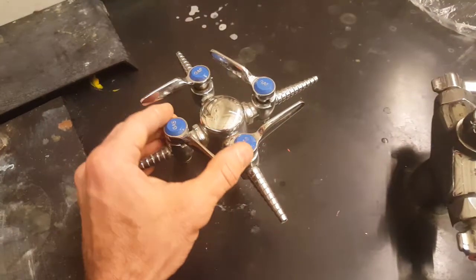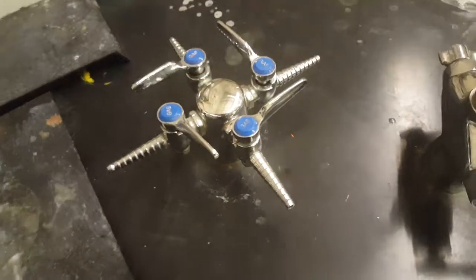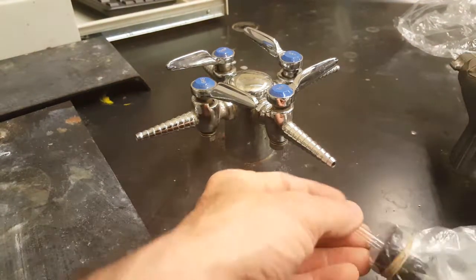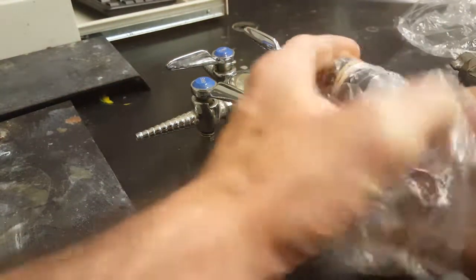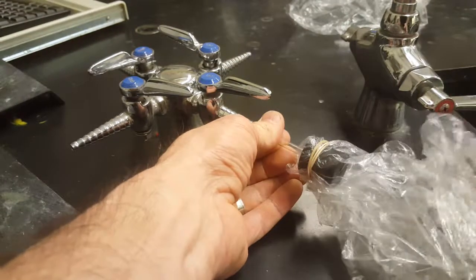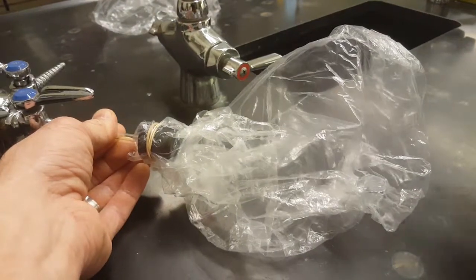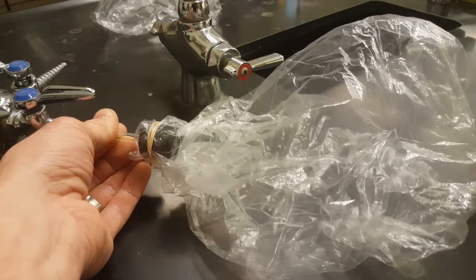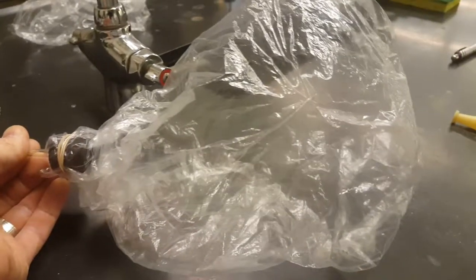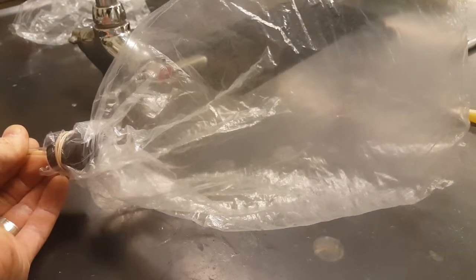I'm going to give you a quick tour of the lab. Here is the methane gas. You'll find the methane; it comes out of the same valve as for the Bunsen burners. To fill your gas, this is the only one I'll demonstrate. To fill your bag, of course, evacuate it first and turn the methane on. Try to seal that with your fingers. The methane smells really bad. It's doped with hydrogen sulfide so that it smells like rotten eggs. Because we can't smell methane on its own, we don't know when it's leaking, when it's a fire hazard. So we put another stinky gas in there so we know when there's a leak. And the room will smell really bad if you let a lot of this stuff leak into the room.